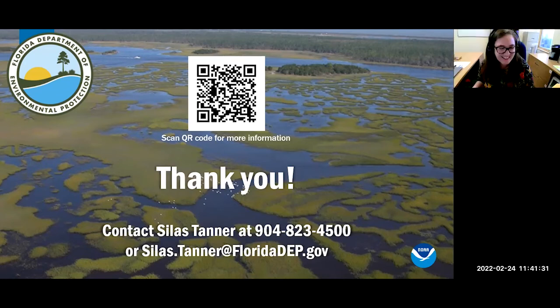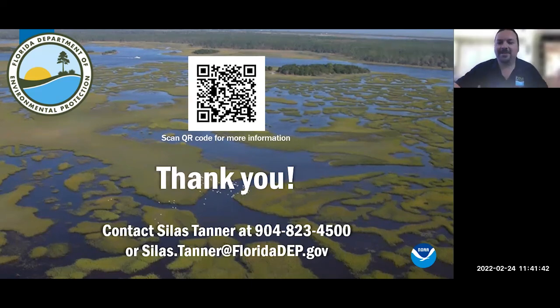Got a few more questions for you. Are you able to distinguish between the chlorophyll A that is in active living cells versus chlorophyll A that is not? Great question. Yeah, so this sensor is specifically targeted to wavelengths that are targeted towards chlorophyll A. And you've got the degraded chlorophyll A, which, as was mentioned, is not active or not in living cells. It fluoresces at a different wavelength, so we can avoid the interferences of those accessory pigments and phaeopigments based off of that specific excitation and emission spectra.